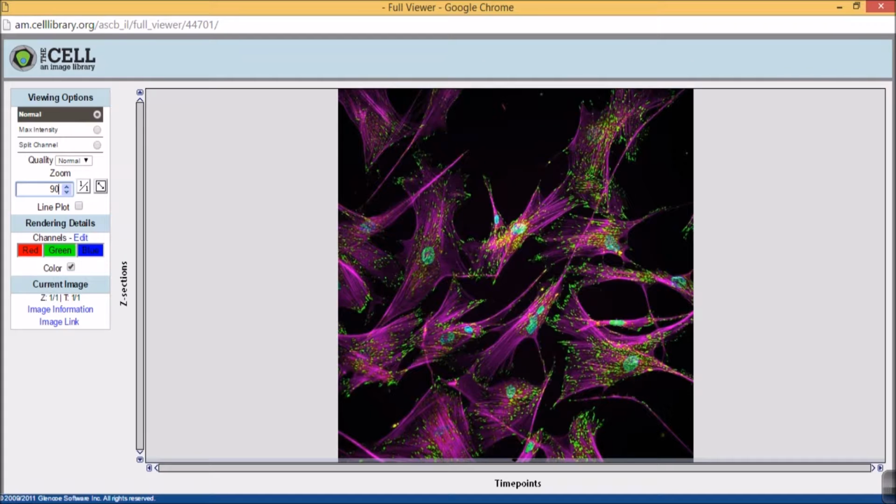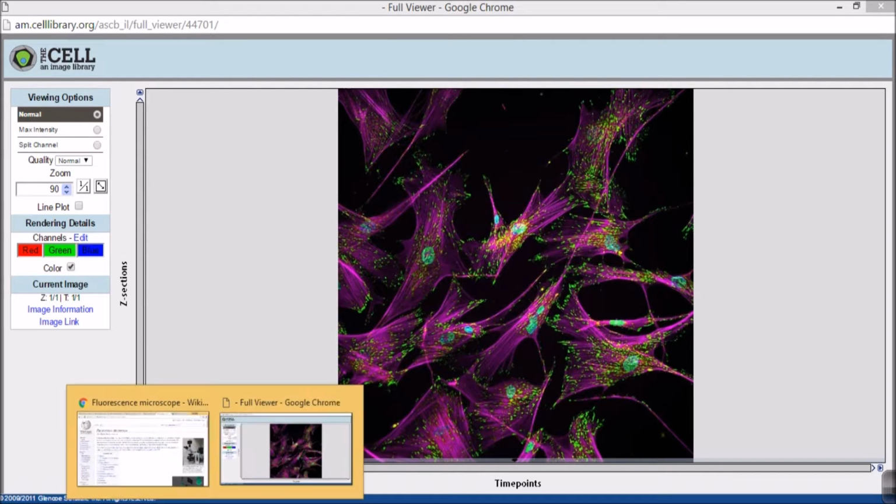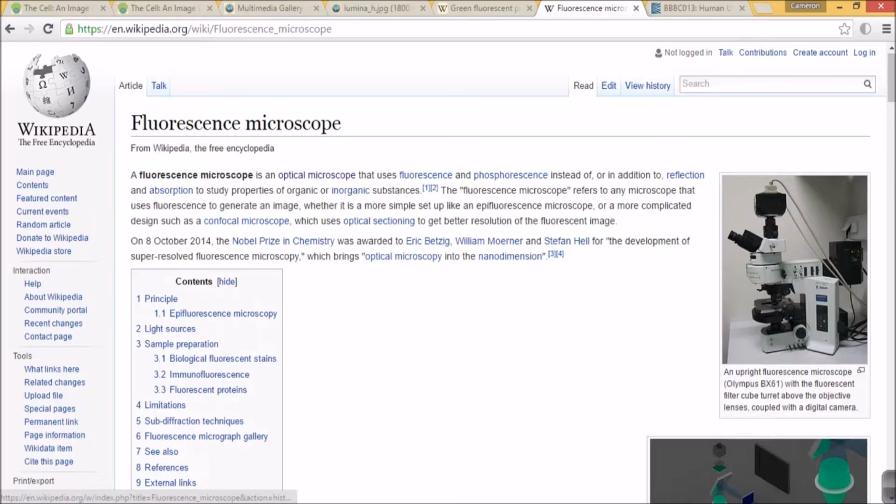An image from fluorescence microscopy is a measurement with physical significance. It provides a lot of information. Greater fluorescent intensity at a specific point in an image means that more of the fluorophore was present at that position in the subject. If more fluorophore was present, then there was also more of whatever it was labeling. So, there's a correlation between the image's intensity and the abundance of very tiny details of the subject.